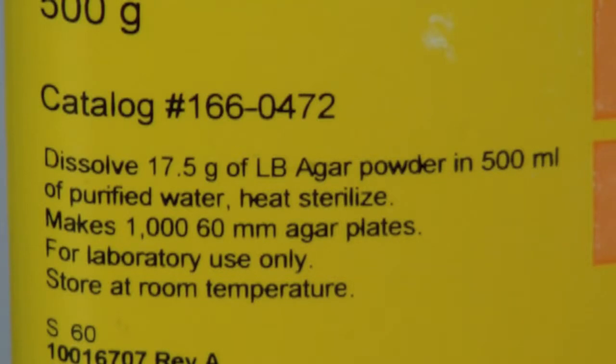The recipe calls for dissolving 17.5 grams of LB agar powder in 500 milliliters of purified water to make 1,000 60 millimeter agar plates. This converts to using 3.5 grams of LB agar powder for the 100 milliliters of media we wish to prepare.